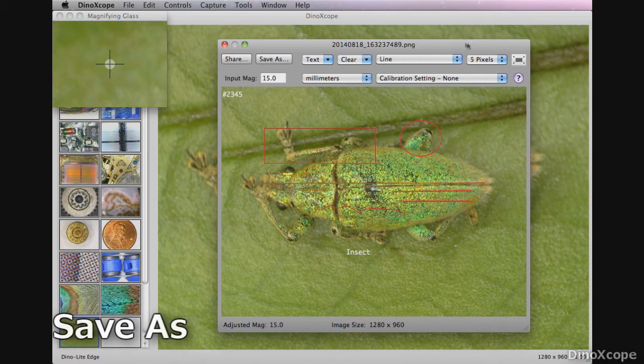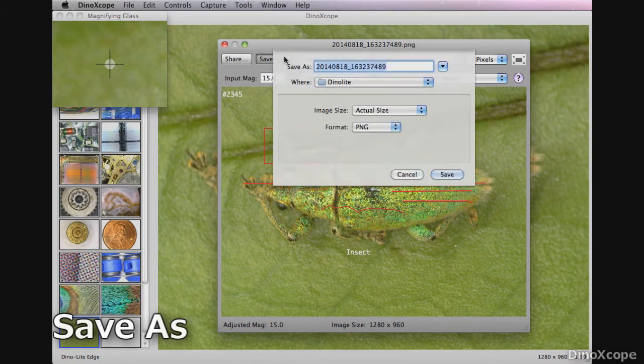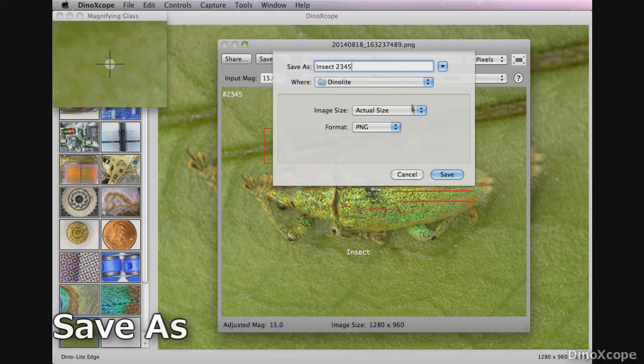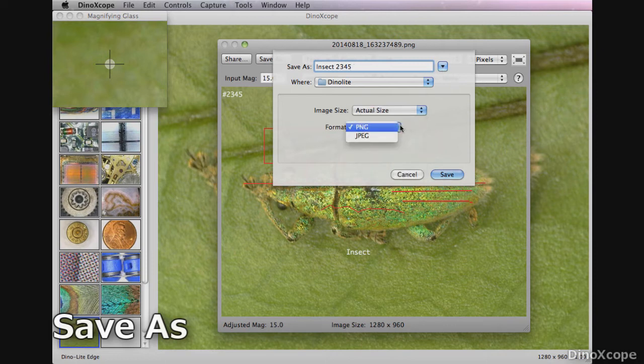Users can save images from the image window or right click on the thumbnail and select save as. Here you can choose the file name, file save location, image size and file format.